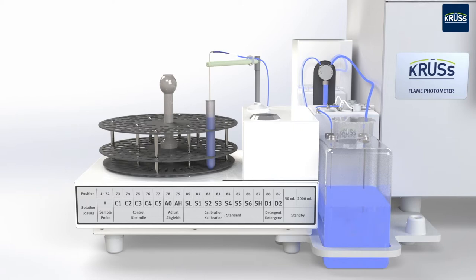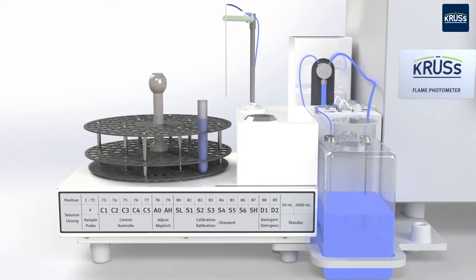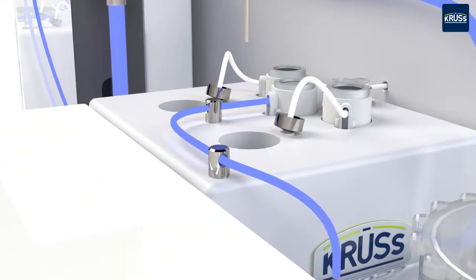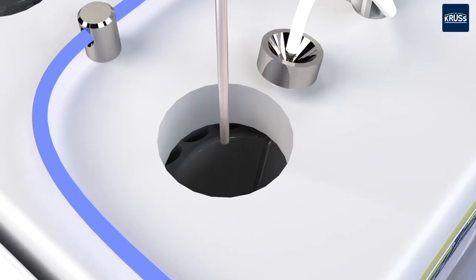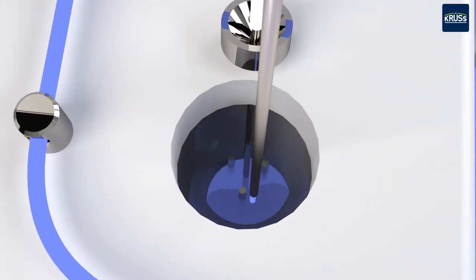Sample material is transferred by a precise dosing unit from the auto sampler to one of two mixing chambers. There it is diluted with an aqueous standby solution to an ideal concentration.